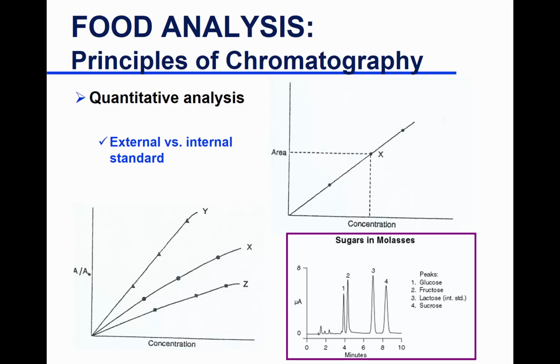So all of your external standards, different concentrations, and all of your samples get the same amount of an internal standard, same volume, same concentration of an internal standard. So it goes in all of the standards and it goes in all of the samples. You need external standards. You can't quantitate without external standards. Don't get me wrong. You need it. Okay. And then here's how you plot.